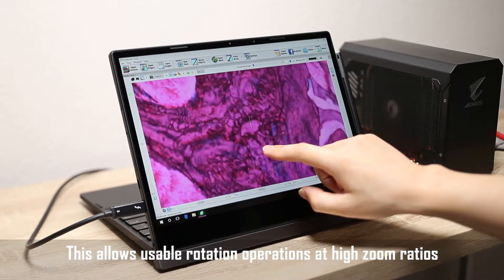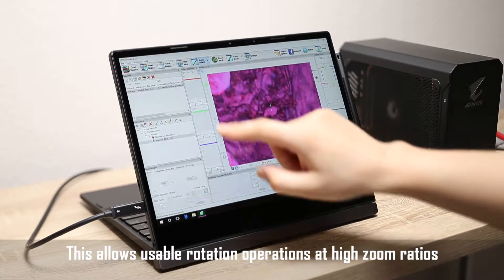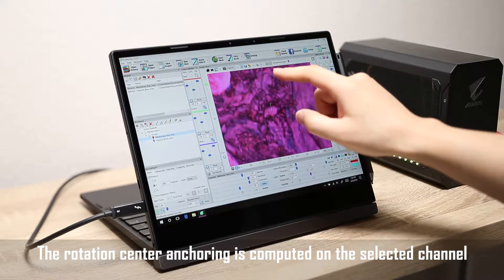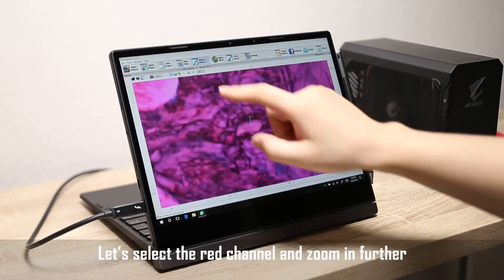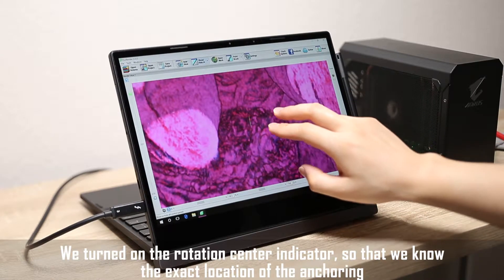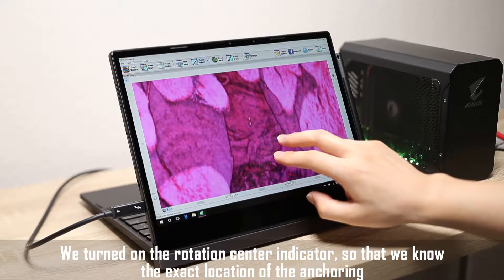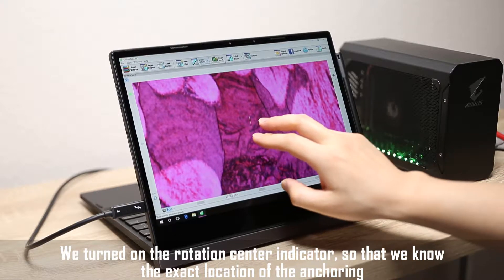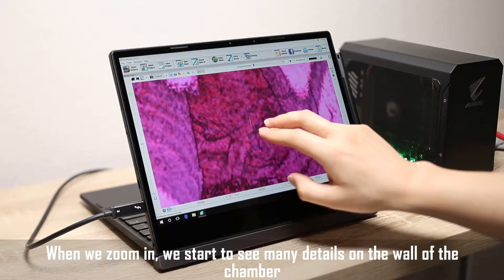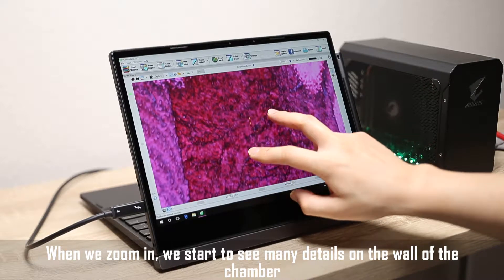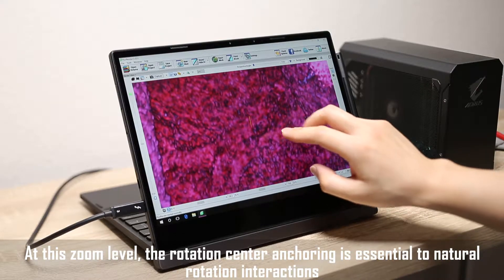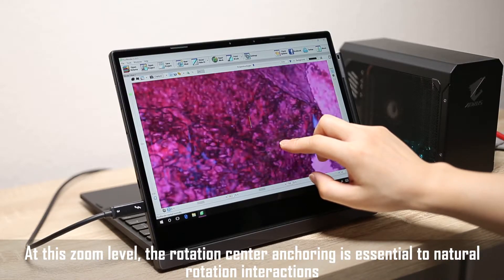This allows usable rotation operations at high zoom ratios. The rotation center anchoring is computed on the selected channel. Let's select the red channel and zoom in further. We turned on the rotation center indicator so that we know the exact location of the anchoring. When we zoom in, we start to see many details on the wall of the chamber. At this zoom level, the rotation center anchoring is essential to natural rotation interactions.